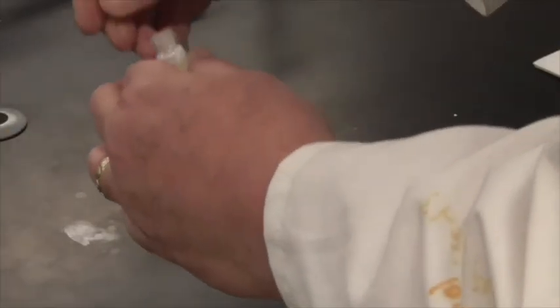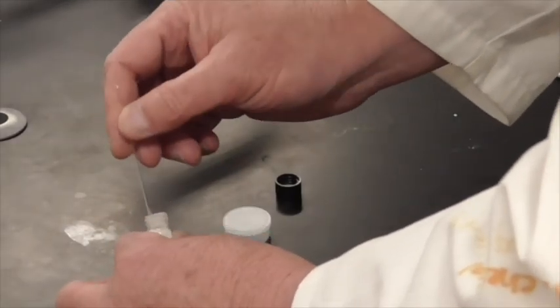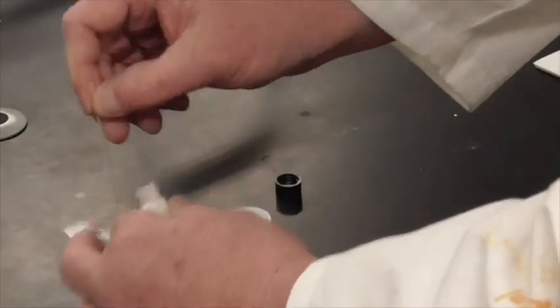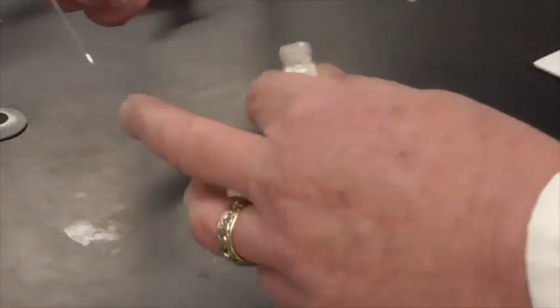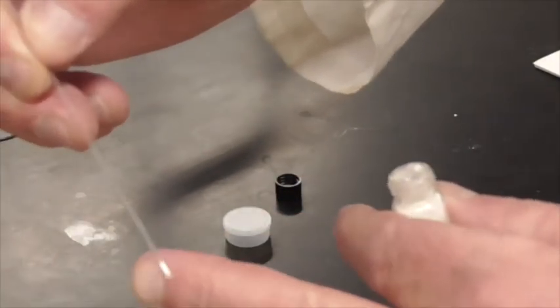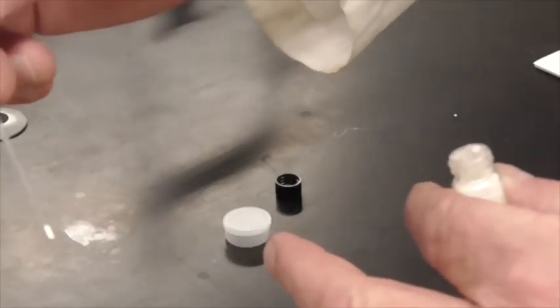Okay. So we're going to do a second one of those real quick, and then we'll have our 2 samples that we need for the melting point of an unknown. And actually that one looks pretty good. You can see that it's got a little bit in the end of it there. That's all we need. Alright, so those are set. Let's go get their melting points. Again, we're looking for a range for the melting point. We're looking for when they first start to melt, and then when it's all liquid.